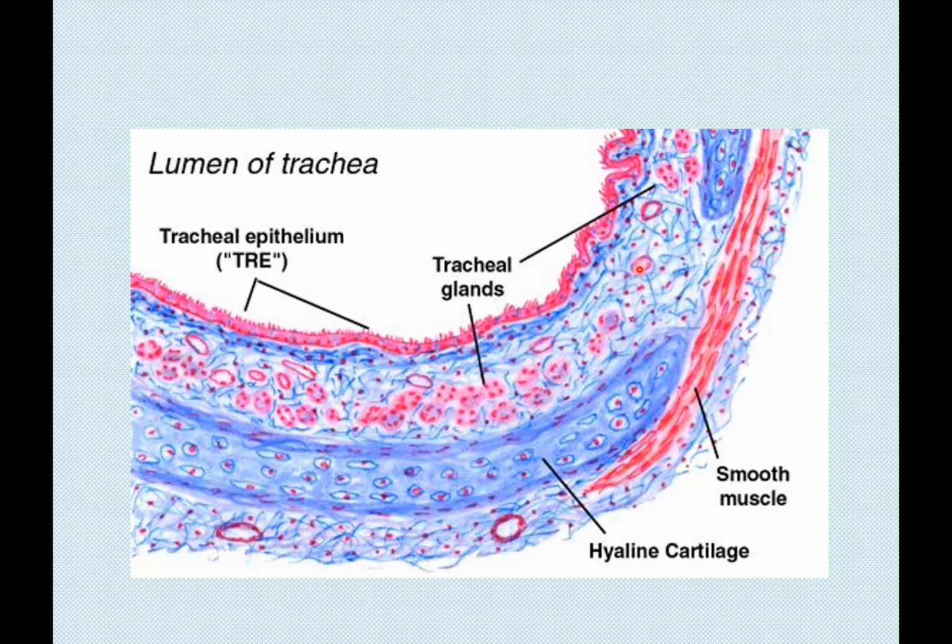Then what about these ones? What is it? They are also round. Who would want to try? Anybody? Let me see. Richmond. So the glands. What type of glands are they? Seromucous. Seromucous glands. That's good. It means you guys are following.